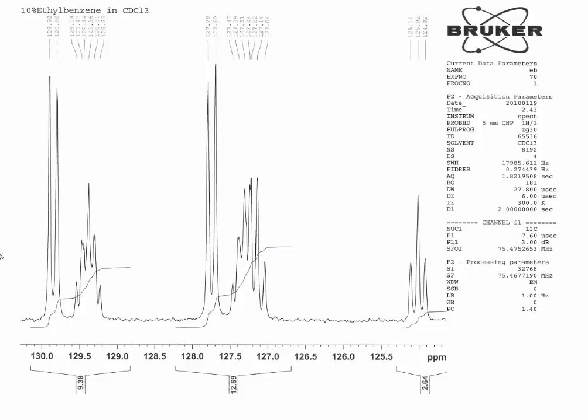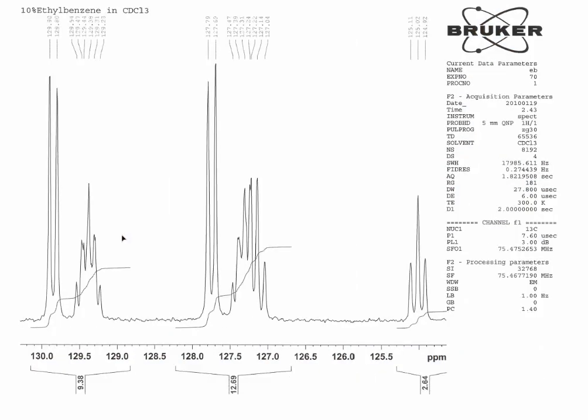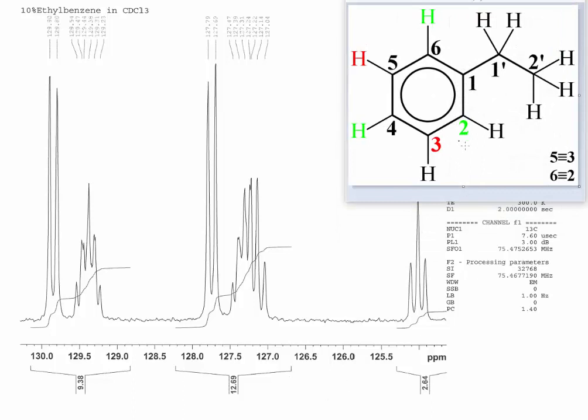But let's go back and I'll do this one more time. Here's the original. Here's the J resolved. Original, J resolved. And let's review again how this relates to the structure. So the doublet of doublets is due to the carbon labeled 3. That's because there would be the splitting and then split again by the hydrogen at 5.